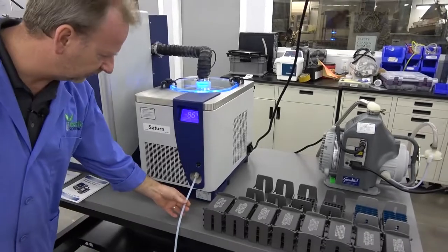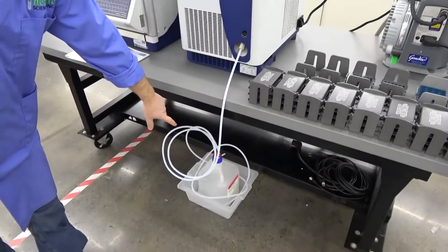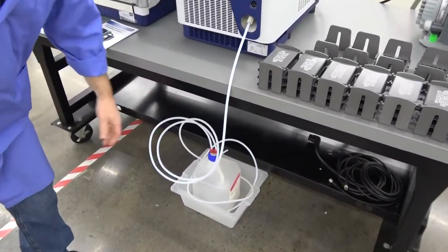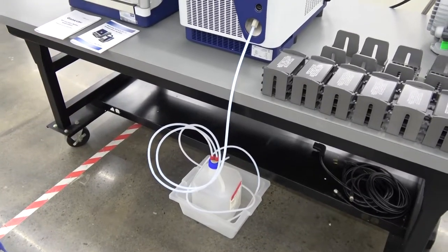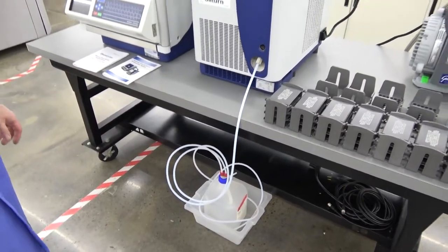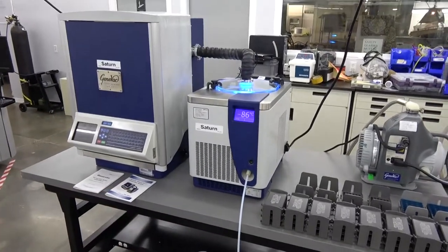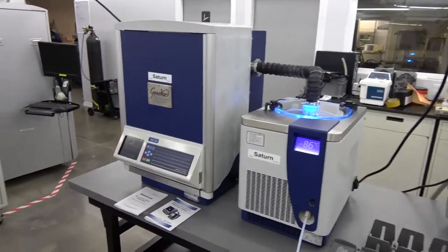Here you got the drain hose hooked up coming down to the waste tub. And then, of course, you'll have your vent tube running if you do have any fumes that you need to exhaust. So everything is here. It's turnkey. It's ready just to plug in, turn it on, and start evaporating.